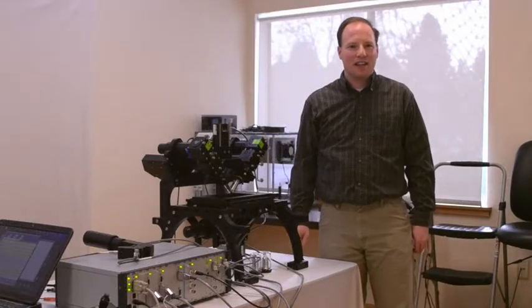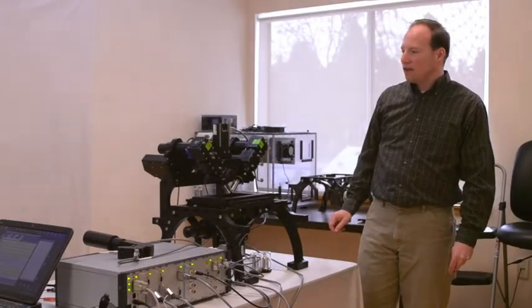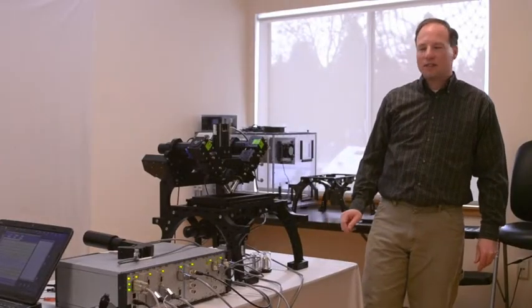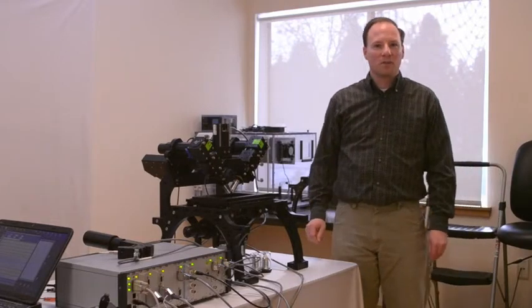Hello, my name is John Daniels, and I'm going to give you a brief tour of ASI's DI SPIM system as used for fluorescence microscopy.